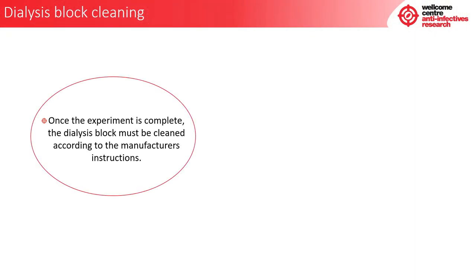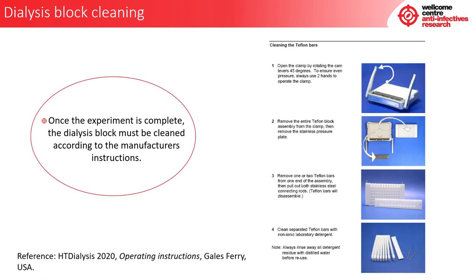Once the experiment is complete, the dialysis block must be cleaned according to the manufacturer's instructions. The instructions from HT Dialysis are as follows: open the clamp by rotating the cam levers 45 degrees — always use two hands to operate the clamp. Remove the entire Teflon block assembly from the clamp, then remove the stainless pressure plate. Remove one or two Teflon bars from one end of the assembly, then pull out both stainless steel connecting rods; the Teflon bars will then disassemble. Clean the separated Teflon bars with non-ionic laboratory detergent and always rinse away all detergent residue with distilled water before reuse.